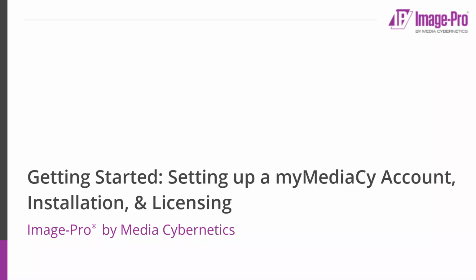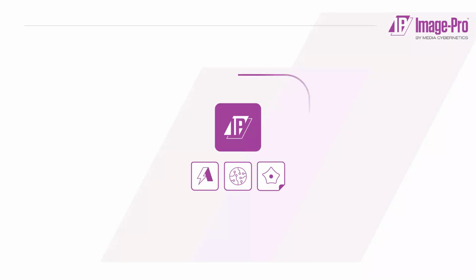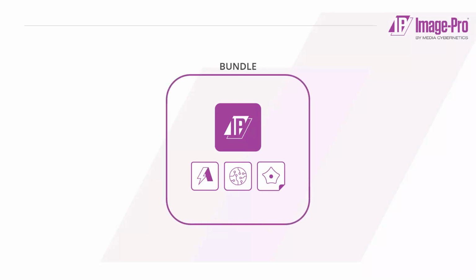In this video, I'm going to describe how to license Image-Pro. We've implemented an easy-to-use, flexible system called license linking. License linking is done using a simple tool called the License Manager. Licenses for the Image-Pro base product, modules, and module extensions are wrapped into bundles. Bundles always include the base product.